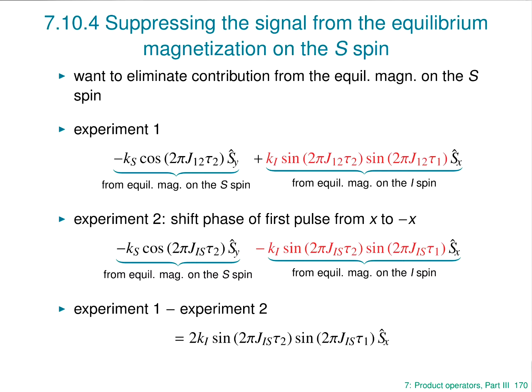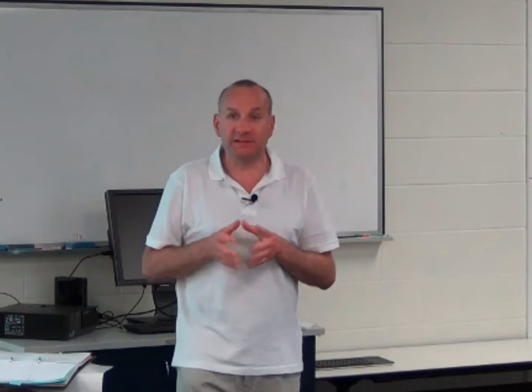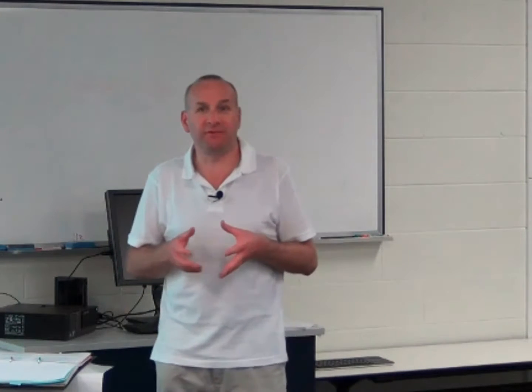It's also an example of phase cycling. It's the first example we've come across. And we'll say a lot more about both difference experiments and phase cycling later on, particularly when we come to 2D. So this INEPT experiment, perhaps now to us it seems trivial.